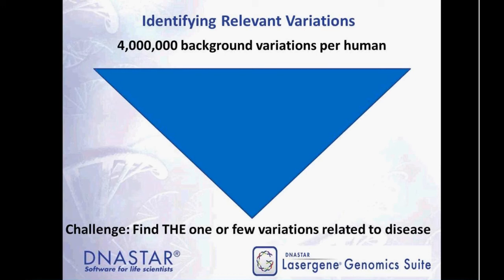And so it may be a SNP analysis, it may be a gene set that is common to the disease group. And so what we hope to do with the software today is to show how we get from sequence data that contains thousands or millions of sequencing artifacts mixed in with real variations, and then try to get those interesting variants to drop out after we filter through the data. So that's kind of the goal today.